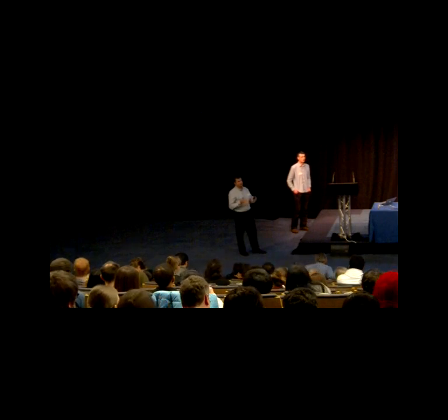The search models, have you curated them in any way, or are they just the PDB stripped of waters? So have you cut them down to cores? We've curated them to a certain degree, but effectively we're using the SCOP database, which are the cut down PDB files. Some of them had problems in terms of the B values, etc. So we try to correct for the obvious errors, but we don't do any kind of intelligent truncations and things like this.